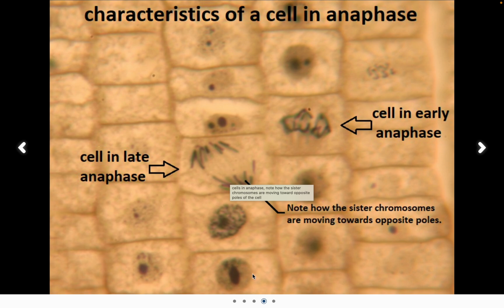You can see that you've got some normal nuclei there with a nucleolus. So we can see some of those things as well. This one, right? You can see this one where it looks like it's starting to form some of those strands. So that's probably a prophase there, right? So hopefully you're starting to get the idea of what these cells look like in these different phases.